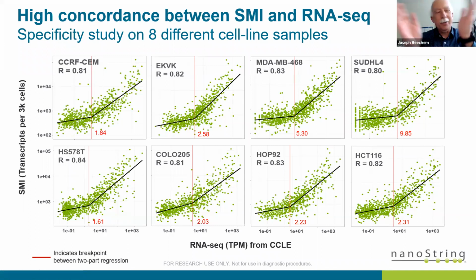If you ever look at those, there are solid tumors in there, liquid tumors in there. They are all very, very distinct cell lines. So when you get correlation of your 1,000-plex over all these cell lines, over all these different types of biology, you can be pretty darn convinced that the biology you're measuring in these assays actually represents the biology in these cells, and also the biology in the various tissue types that we're measuring.